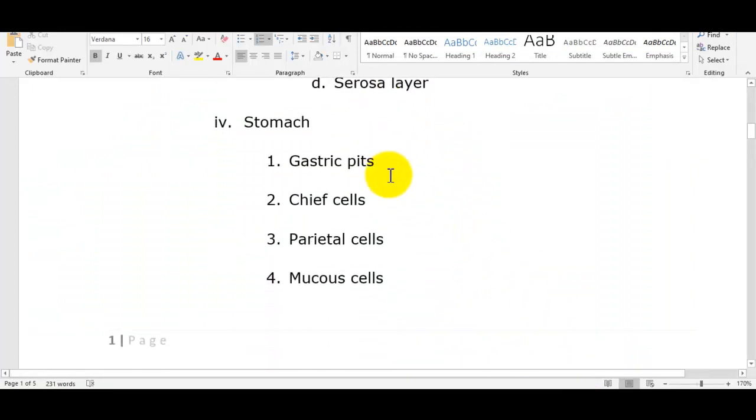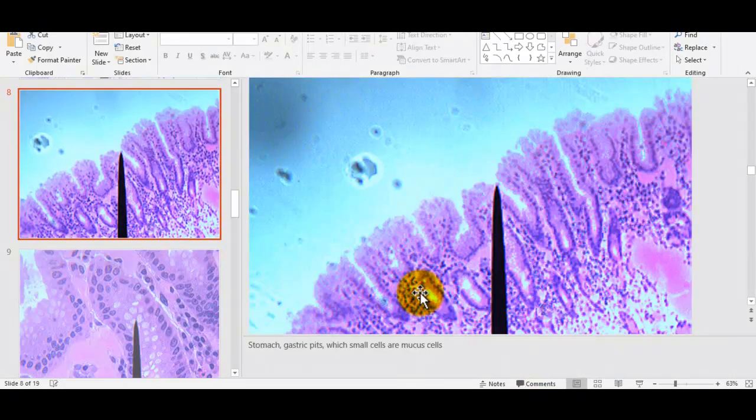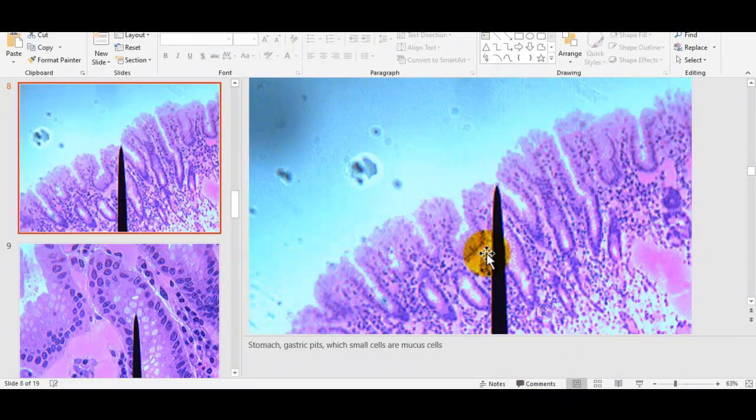Now you got to remember the stomach is folded, that's what rugae are, but the stomach has what are called gastric glands. And on here, this would be the lining of the stomach. Up here is the lumen, it's hollow. And where that pointer is pointing to, see these openings at the top? Okay, this comes down. This is one that's kind of long. So it comes all the way to the bottom and comes all the way back up. That is a gastric gland.